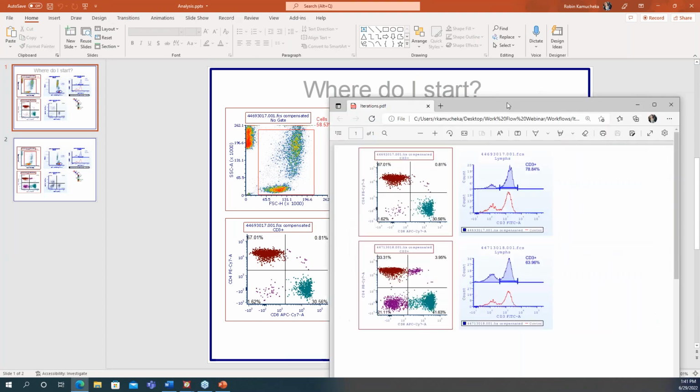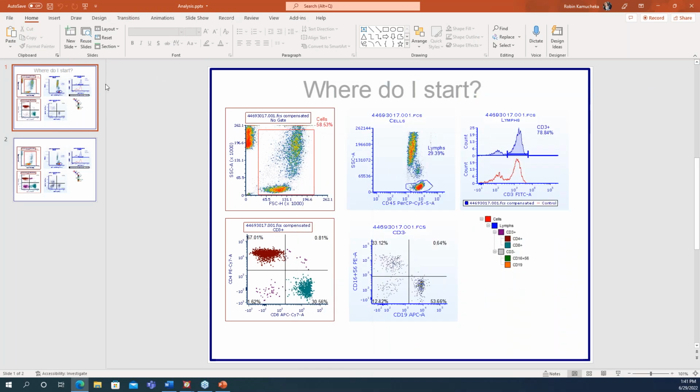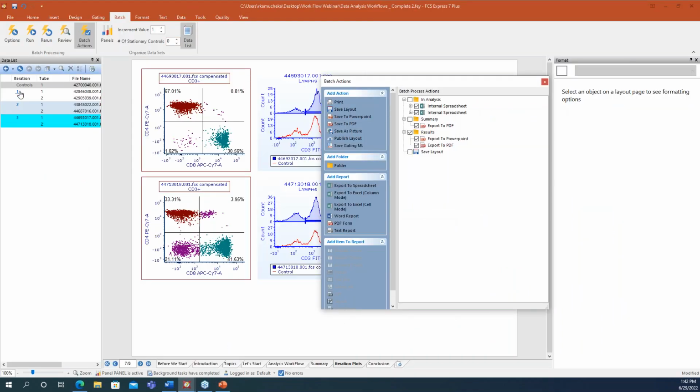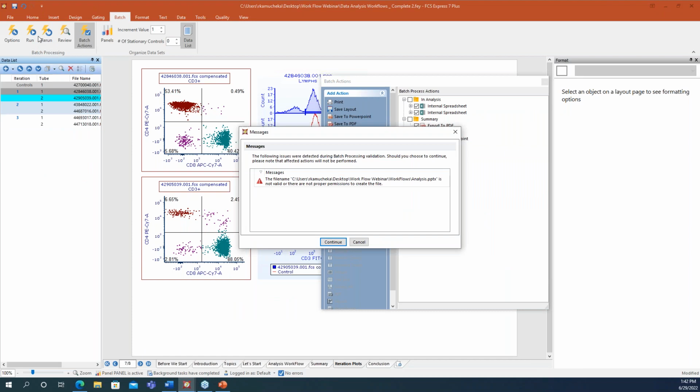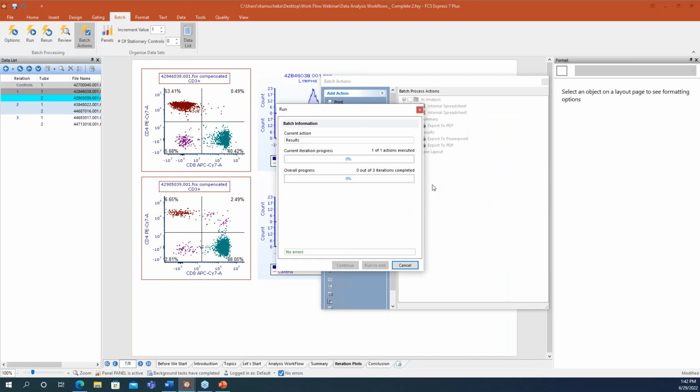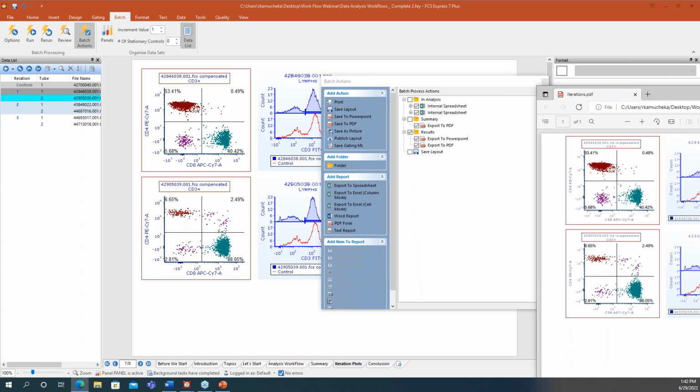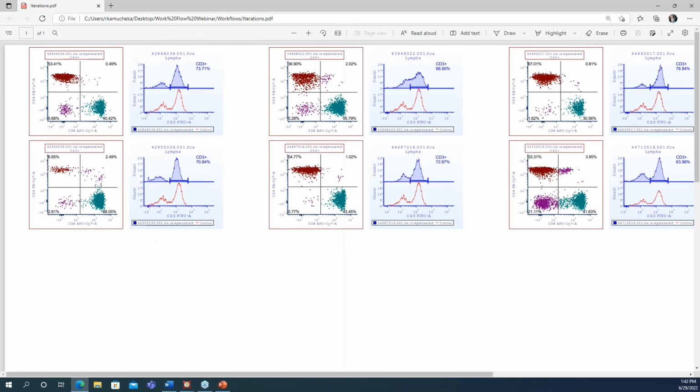And now I'm going to open this. So right now I started with the 3rd iteration. So you see I did that accidentally. Let me pop back to the 1 and rerun that. And there we'll go. Now we have those side-by-side iterations.